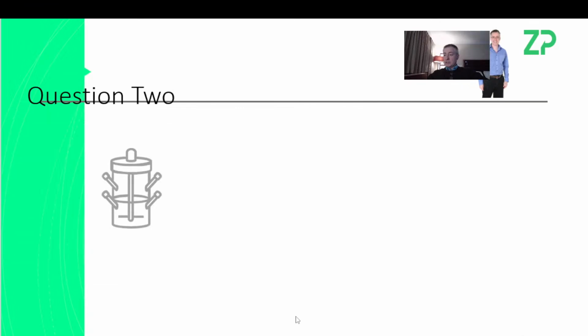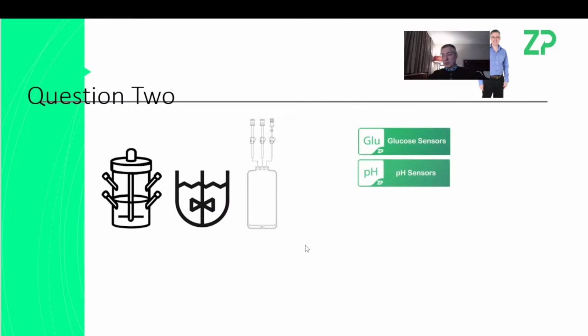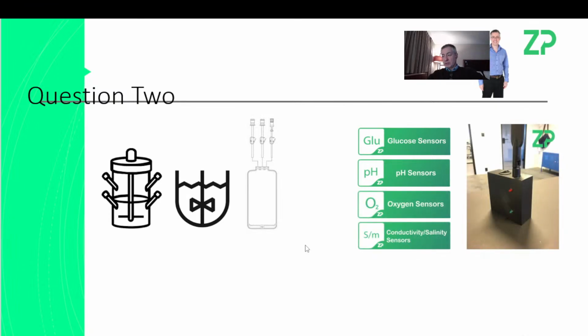The reason that when putting sensors into bioreactors we have to treat it as a bit of a service is that, when you think about it, bioreactors come in so many configurations. The configuration is a variable, the cells could be a variable, the length of time that the cell culture is going to run for is a variable. The solution itself is also a variable. So there are so many variables in this that you can't have a one-product-fits-all scenario.